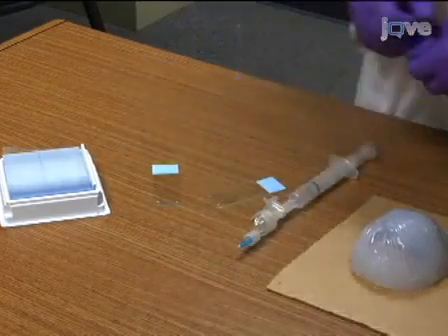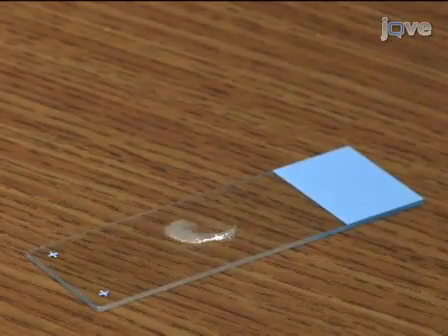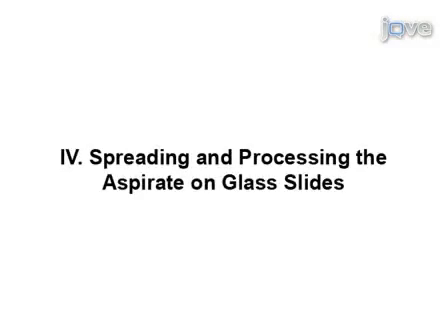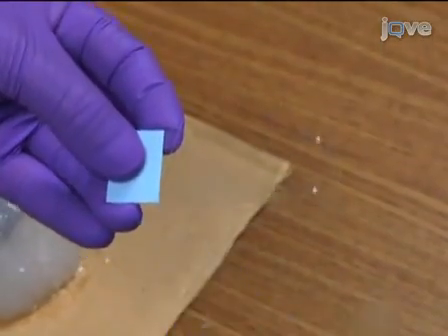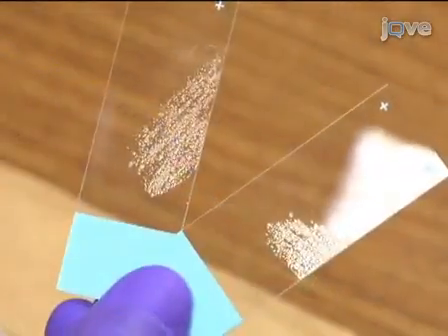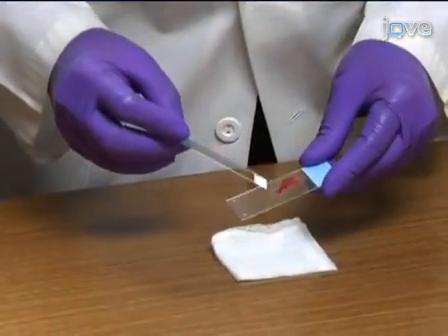Once you've taken the needle out of the lesion, dislodge the aspirated content onto the glass slide to prepare a direct smear. Once you have dislodged a drop of aspirate onto your slide, you can spread it using a variety of methods depending on the nature of the aspirate. We usually spread the sample between two slides using the method shown here.